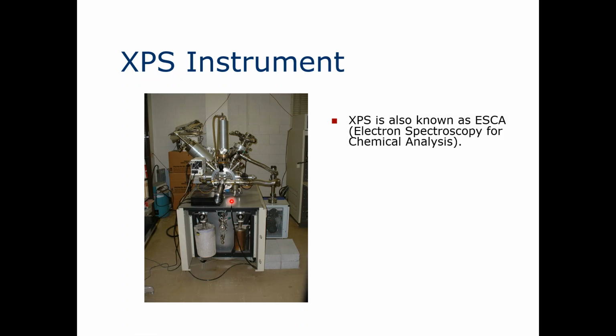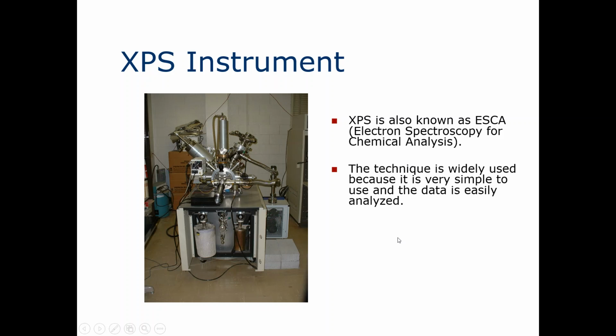The XPS instrument or the XPS technique, we also call it ESCA. What is meant by ESCA? It stands for electron spectroscopy for chemical analysis.